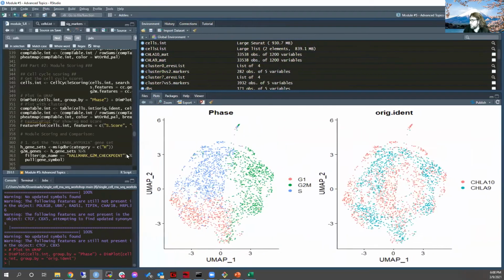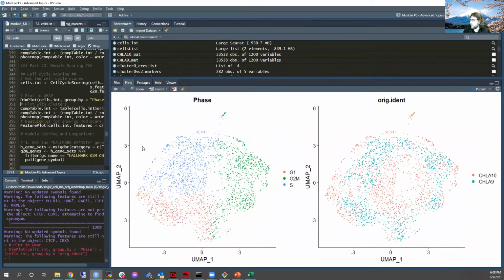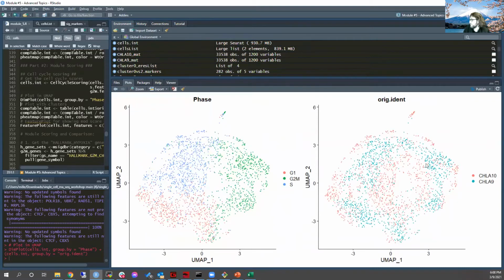So now we can see the cell cycle phase. Okay, so the first time I saw this, it actually kind of blew my mind. And it's the reason in some ways why not a lot of people want to do single cell on cell lines. Because I was looking at this donut for like a couple weeks. I hadn't really tried to figure out what it was yet. And it kind of all came together when I saw this. I realized the donut is the cell cycle.